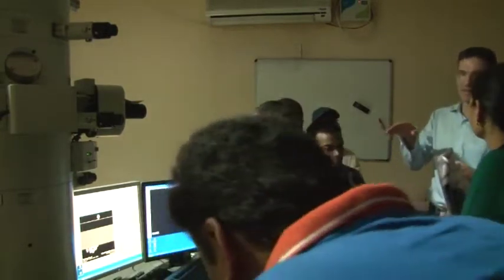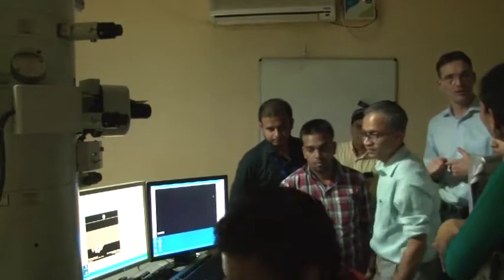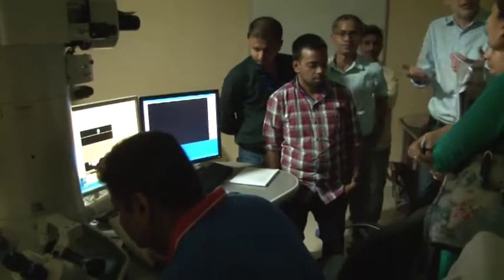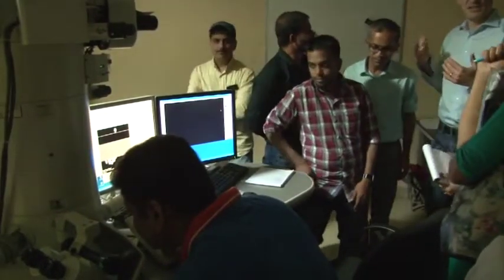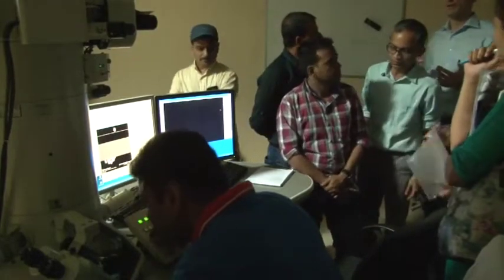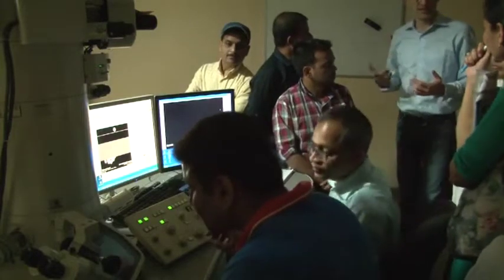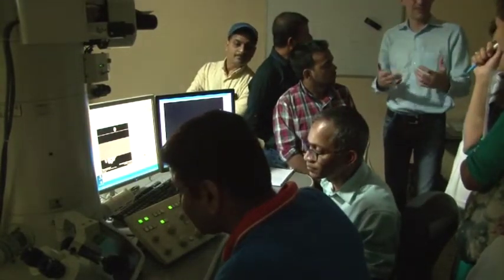In this particular case, commonly the atomic columns appear dark at Scherzer focus. So the atom columns are not bright. Intuitively, you would expect that atoms appear bright, but this depends on the defocus. And with an aberration corrector, you can work, for instance, under negative CS conditions, so you can set a negative value of your CS, you can overcompensate for CS.